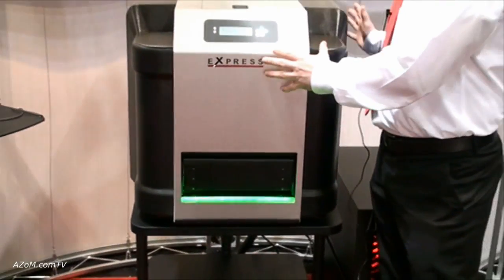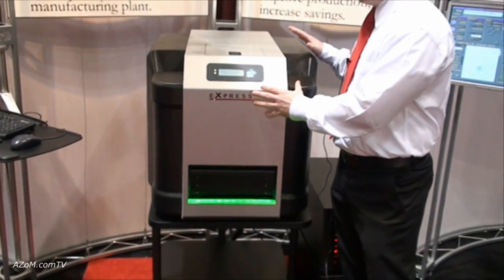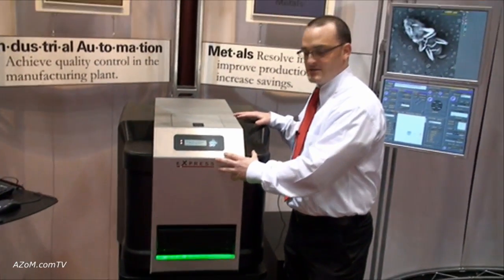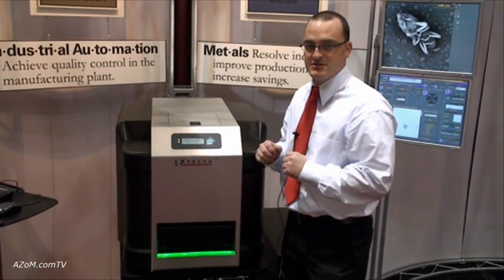Everything's contained in the electron microscope for imaging and X-ray analysis, inside this one box. It's meant to be placed onto a laptop benchtop, as an example.